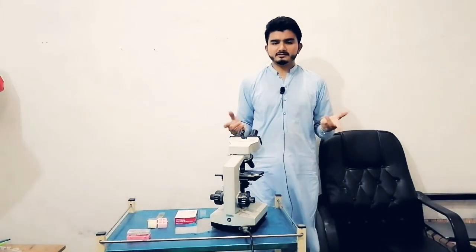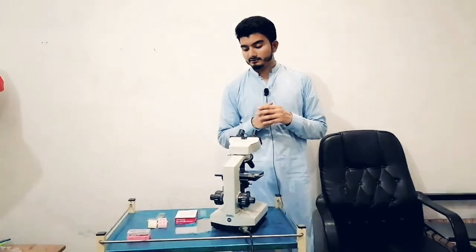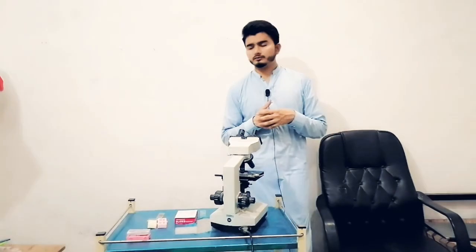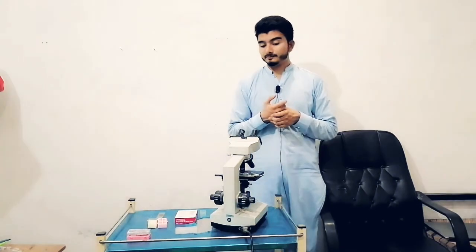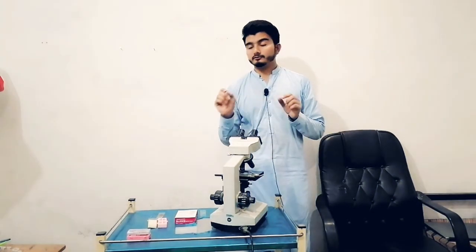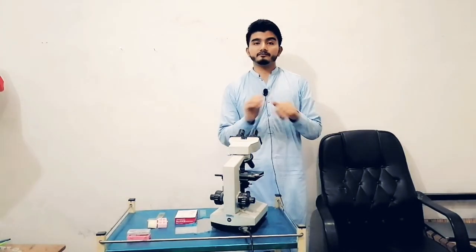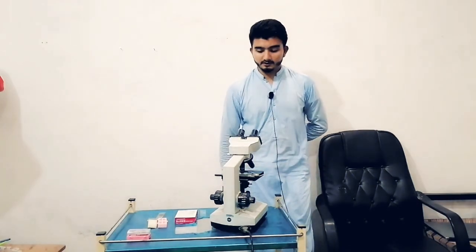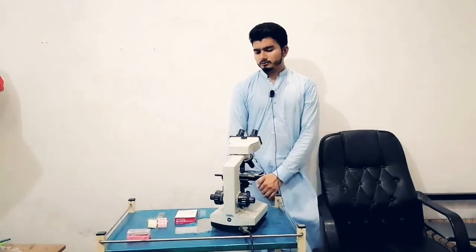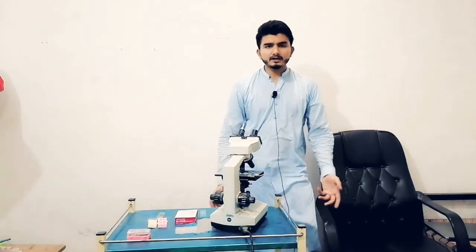Same for stool examination. If you are going to do a stool routine examination, then like that, you should take the stool in normal saline. You should centrifuge it properly, and then take the sediment from it on a slide, and cover it with the cover slip, and after that you should examine it on 40x. So it's all about the microscope, how to use it, and it's quite easy.